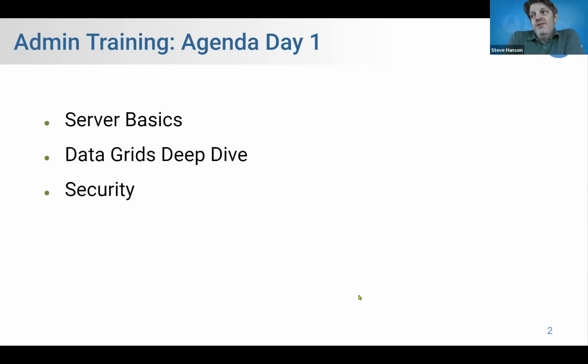Just a little preview: day 2, we're going to look at how to work with laboratory and assay data inside a LabKey server, and also look at data storage generally in the server. So we're going to look at how the database works and how files are stored in LabKey server. I'll probably do another little deep dive topic in there too. I'm not sure what I'm going to do. Maybe the query browser, maybe queries.